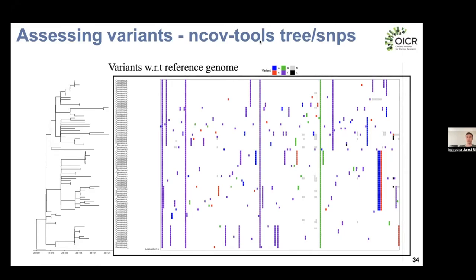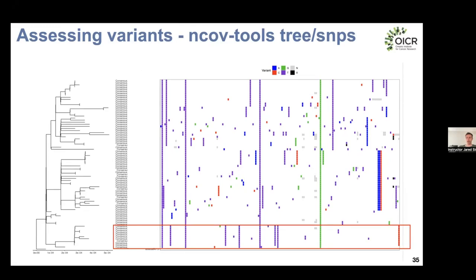So here we can see a lot of sharing of the variation across the samples on this little demonstration sequencing run. For example, this cluster of samples here, it looks like there's about 10 samples in this cluster, all share a T SNP at this position, a T SNP at this one, this one, with the exception of this sample at the bottom, which didn't have a handful of SNPs at these columns.